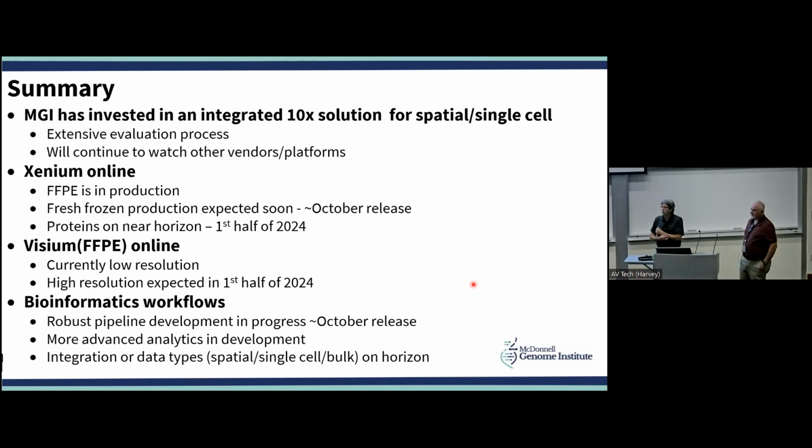And you sell some of the standard panels they have? Yes, standard panels we just order, and that's actually part of that cost. Now, if you're going to do a custom panel, that's a little bit different, and we can get into that, because it's too much to put up here. There are different sizes, different reaction numbers, and all kinds of stuff like that. And it's evolving quickly. 10X had, like I say, yesterday, these small custom panel options and things like that to lower that barrier to some degree. So it's evolving. That one's better handled as a conversation.